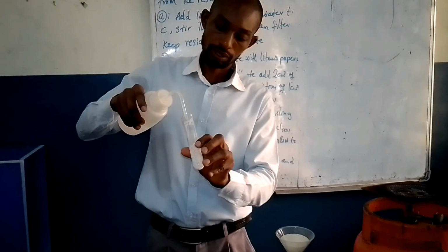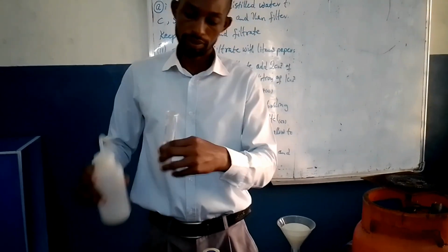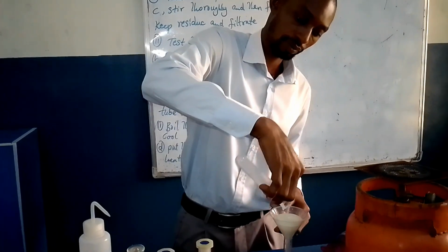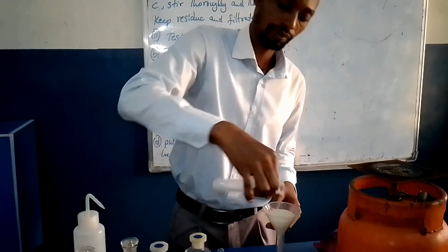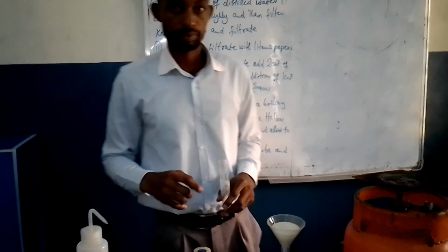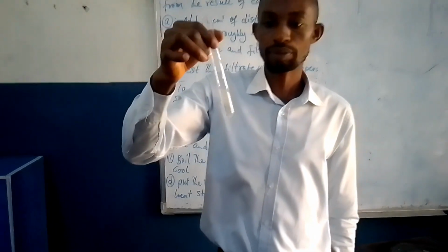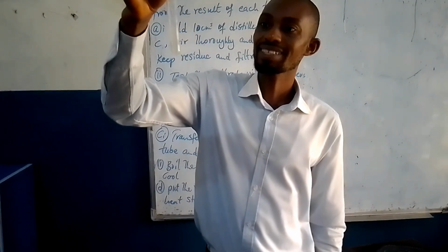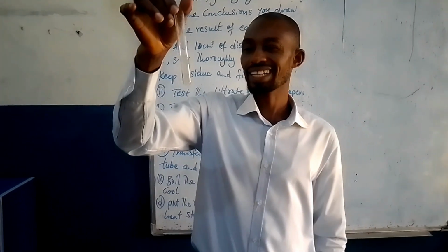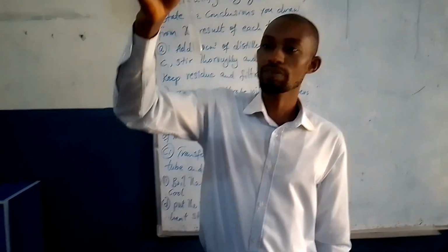It will take quite some time. Because our filtrate is not totally clear, we have to get a clear filtrate, so I'm going to refilter this again.